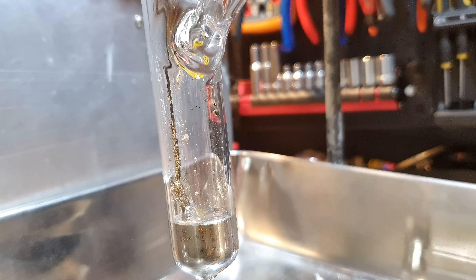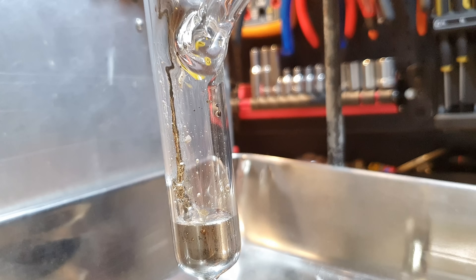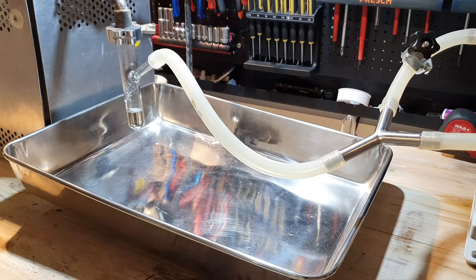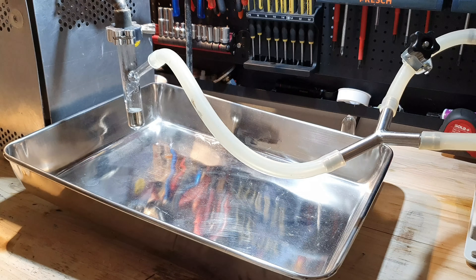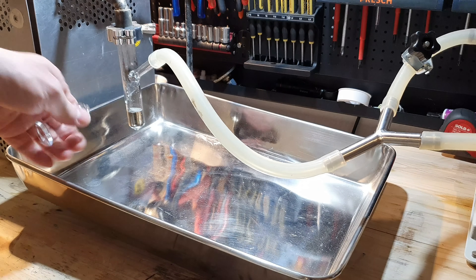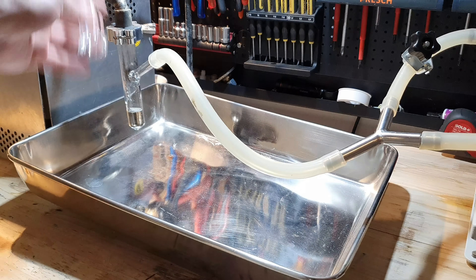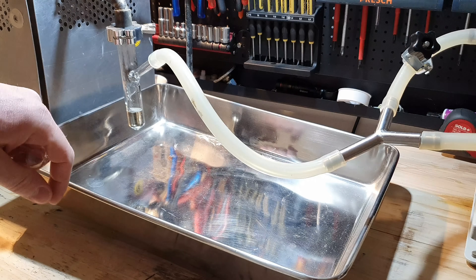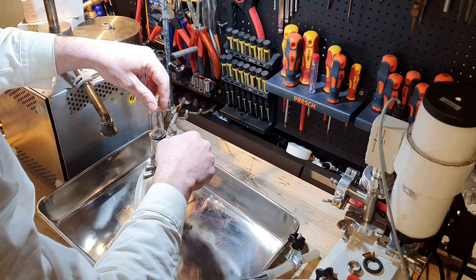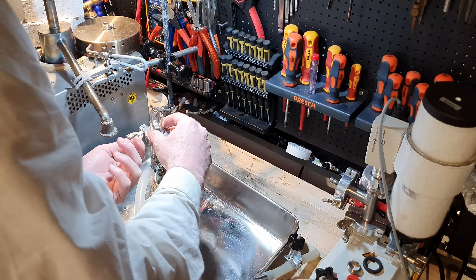Even though I have done this reaction many, many times, it is still a pleasure to watch the cesium drip into the receiving flask. Now that we've got our cesium, I'm going to turn off the vacuum pump and flood the system with argon. I'm then going to disconnect our reaction vessel and use this flange to seal it on the top. Then we can pull a vacuum on it and slowly let oxygen into our reaction vessel.